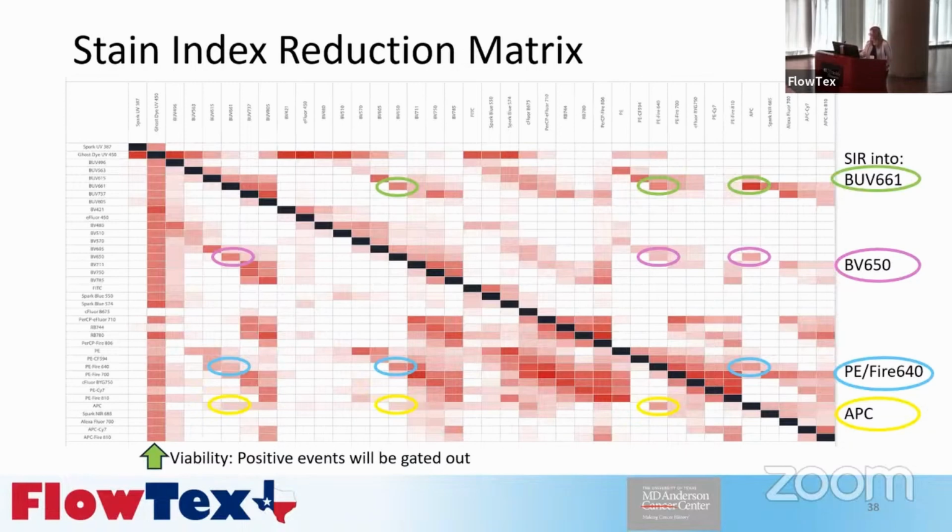Okay. And I was just going to say again, you note that my viability here in UV450, I like this channel because it does spread into everything, but I never look at dead cells, which are the positives. So as I look at the matrices, they're all going to kind of give me the same information, right? So the next talk, I think, is Peter Mage, and that will be very much interested in what the numbers mean here. For me, I'm really looking at color codes for the purpose of this talk.